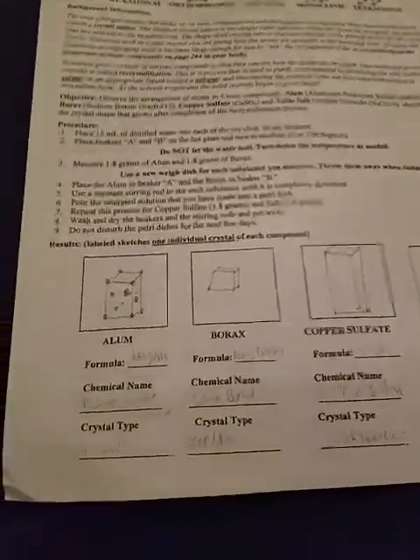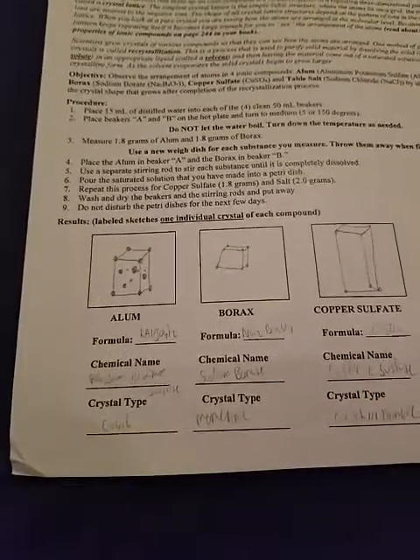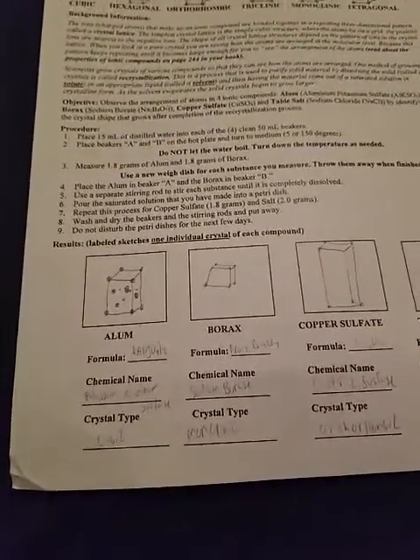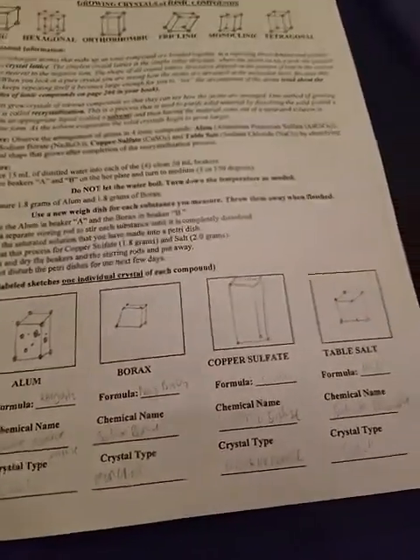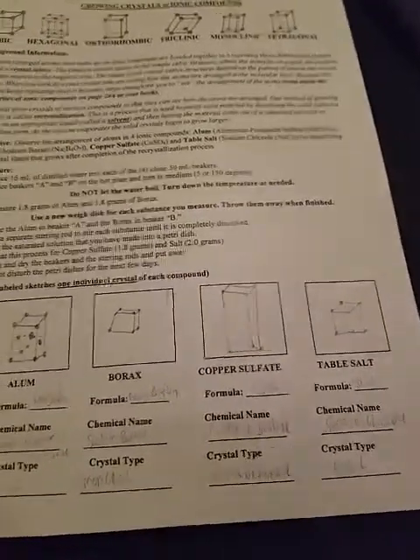And for alum, our group found that the crystal type was cubic. For borax, we found that it was monoclinic. For copper sulfate, we found that it was orthorhombic. And for table salt, we found that it was cubic as well.